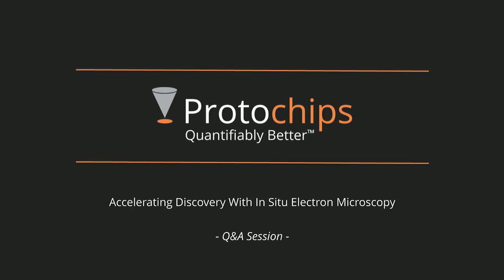Let's see. Someone points out that from the still life images of TEM 9 years ago when this person retired, they're seeing enormous leaps and bounds. If you're rearranging atoms to manufacture a wire structure, how do you manufacture on a larger level?